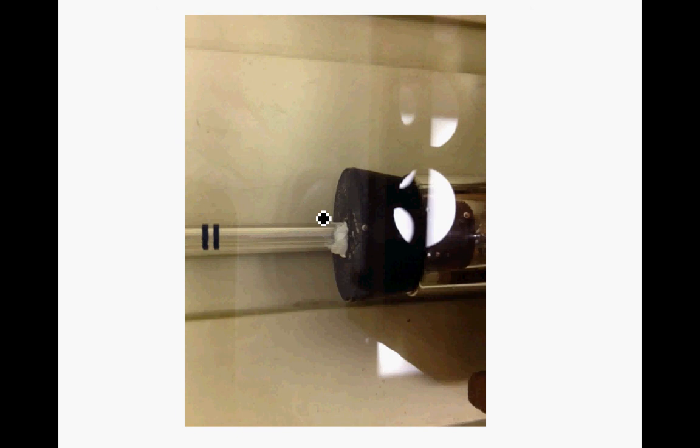If you see that meniscus and then all of a sudden it starts to move real quick, that means that you might not have a tight seal right here, and you might see bubbles of gas, oxygen, coming out of there. If that's the case, you have to stop, take this out, and restart the whole thing. So you have to get a new stopper, a new pipette tip, etc., and then resubmerge that, okay?